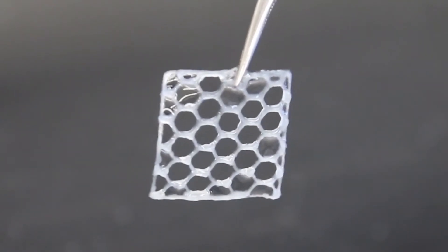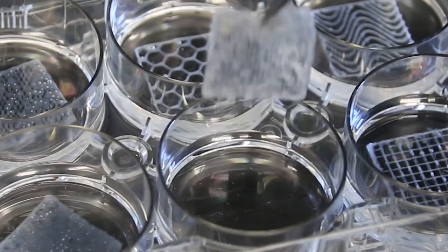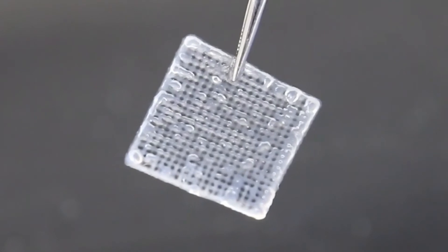We are creating new architectures, very controlled architectures that we could not fabricate in any other way without the bioplotter.